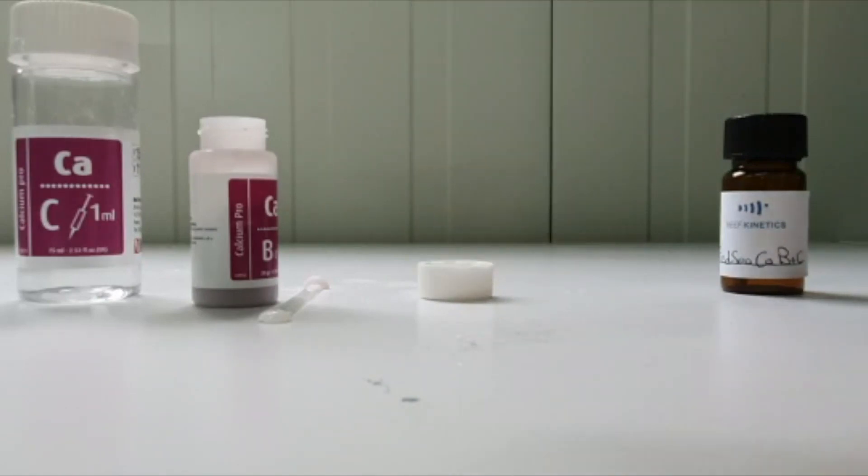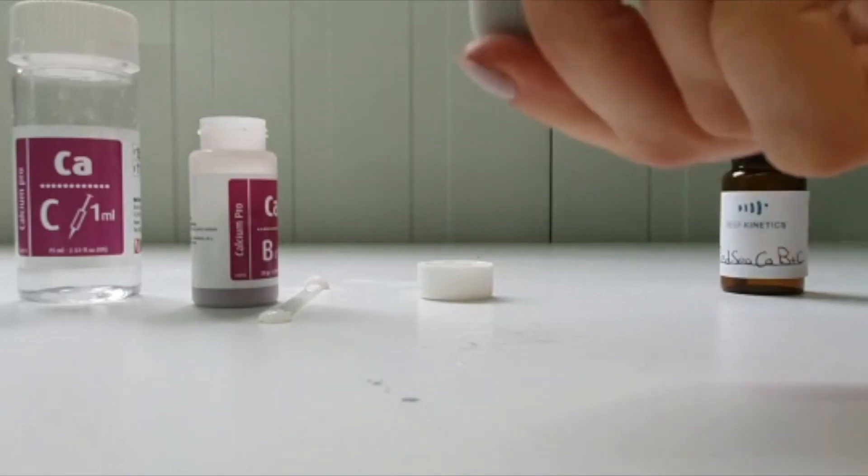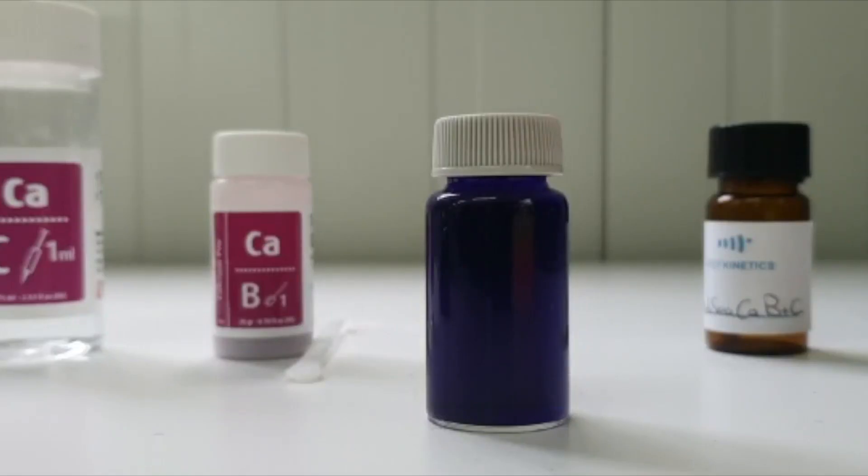Make sure that you dissolve all the solid particles in the vial. Now we have a dark blue clear solution. We have to empty it into an amber vial supplied by the kit.